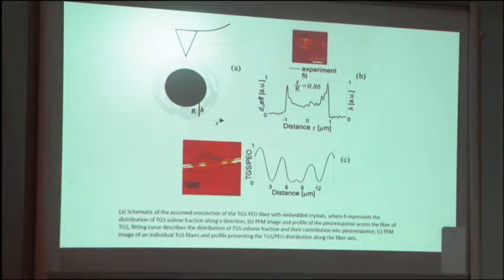Distribution of particles, because our method is very local, and the resolution, of course, is not 2 nanometers, as I'm saying. 2 nanometers is the maximum for topography. Piezoelectric measurement has a relatively lower resolution, but 10, 20 nanometers is possible.